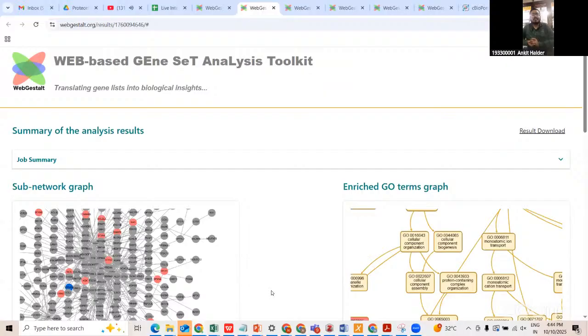So now here you have seen different pathways like KEGG, Reactome. I would request Amit to show Reactome, how the database is made. You have seen that we are using it, but you can use those databases as well to understand and identify the different pathways. Yeah. All right. Thank you, Ankit.